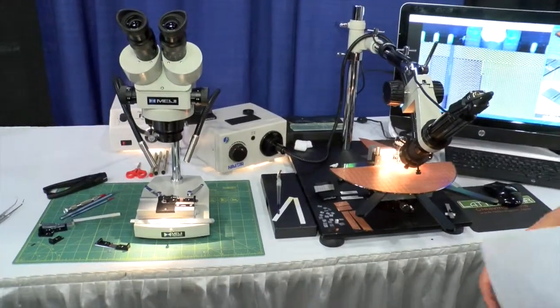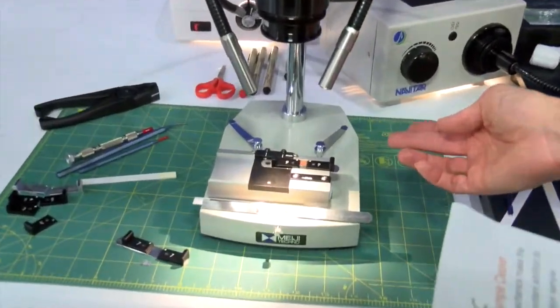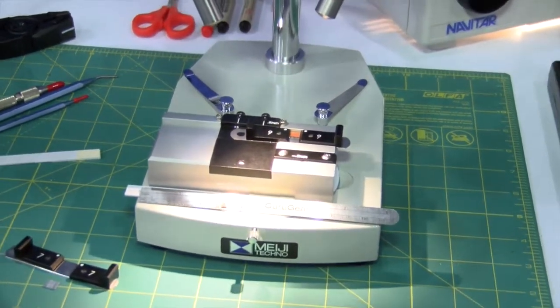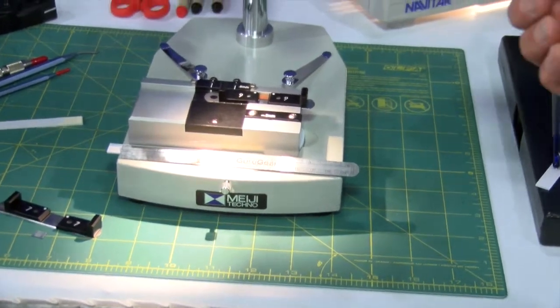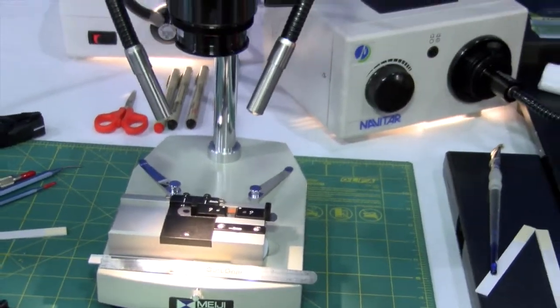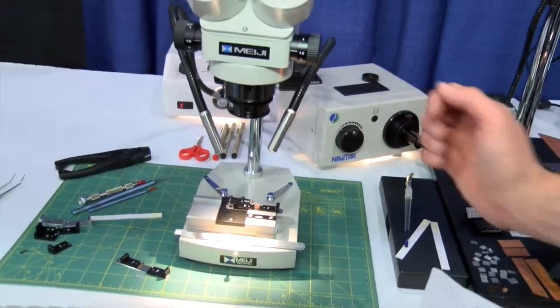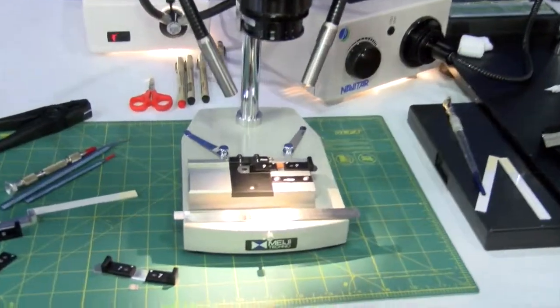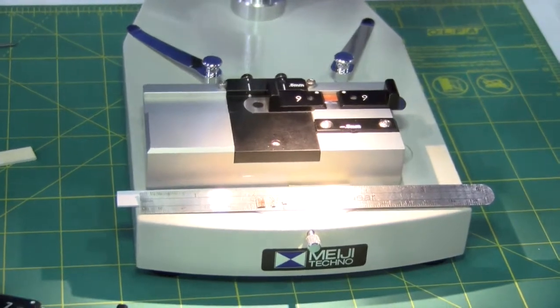The new small sample cleaver includes a hold down that handles the samples and avoids handling with fingers. No screws, no springs, no pins. This will allow you to use the LatticeX during indentation and then pass the sample over to the platform which will allow clean cleave down to two millimeter samples.